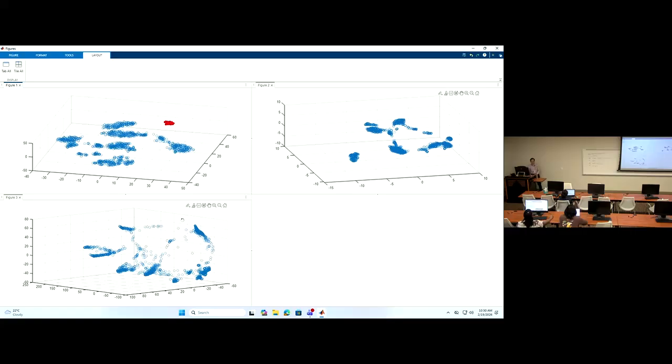So although you know how to run this through the command line, sometimes you really want to utilize the toolbox interface to help you have this multi-dimensional view of the embeddings.